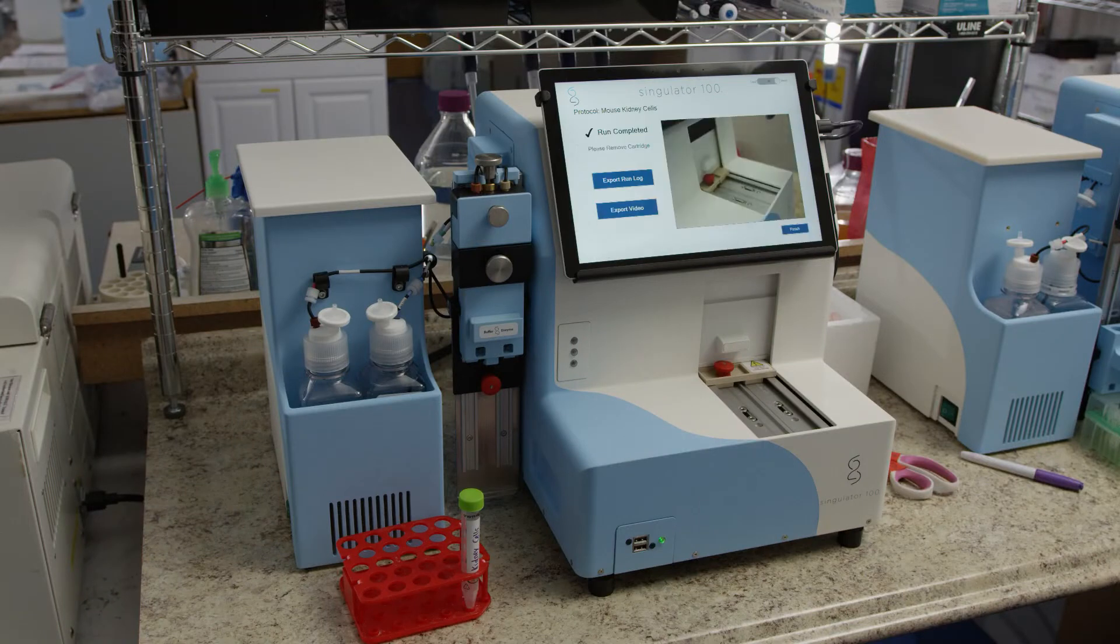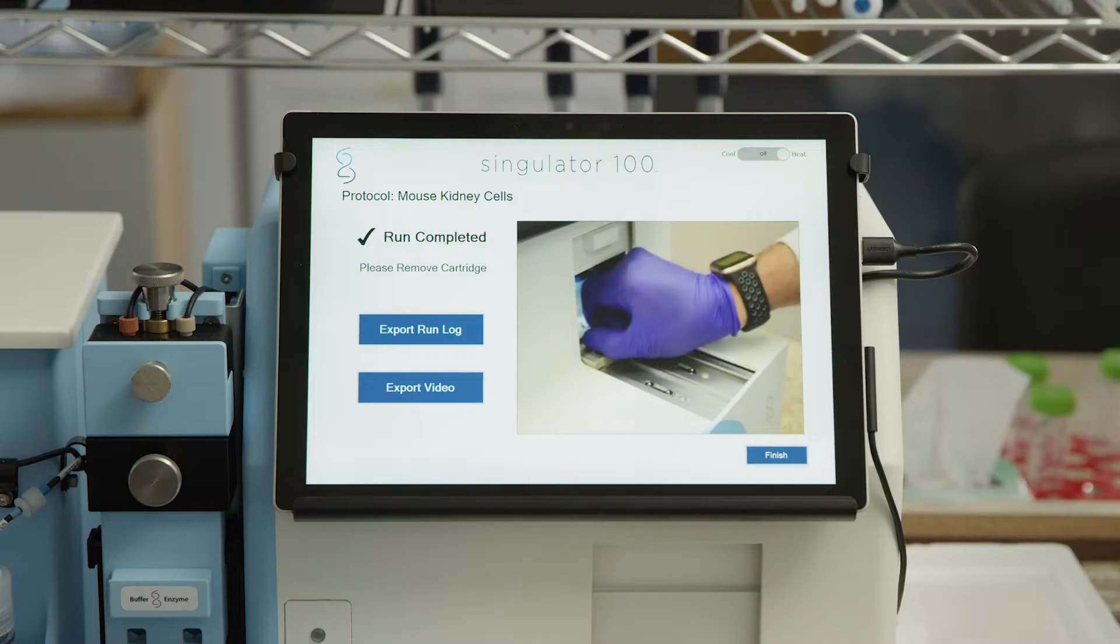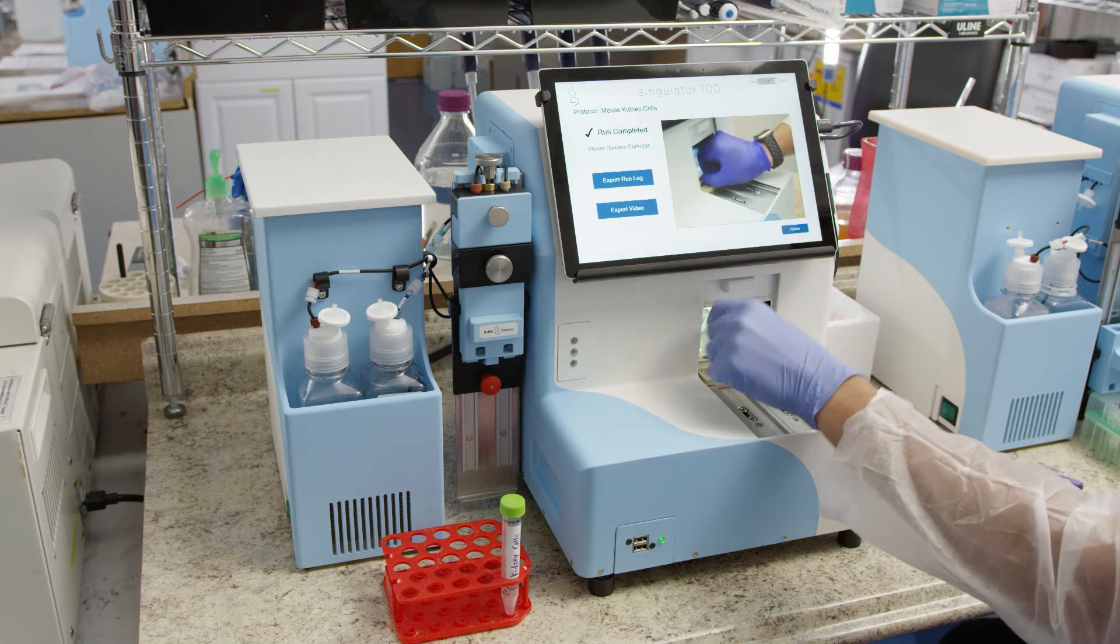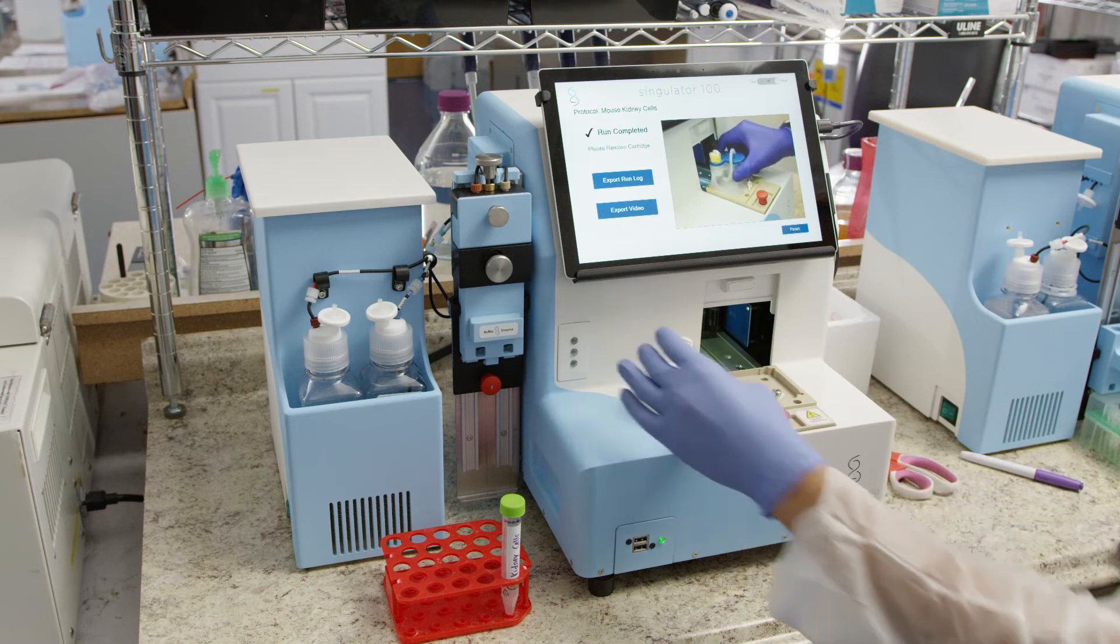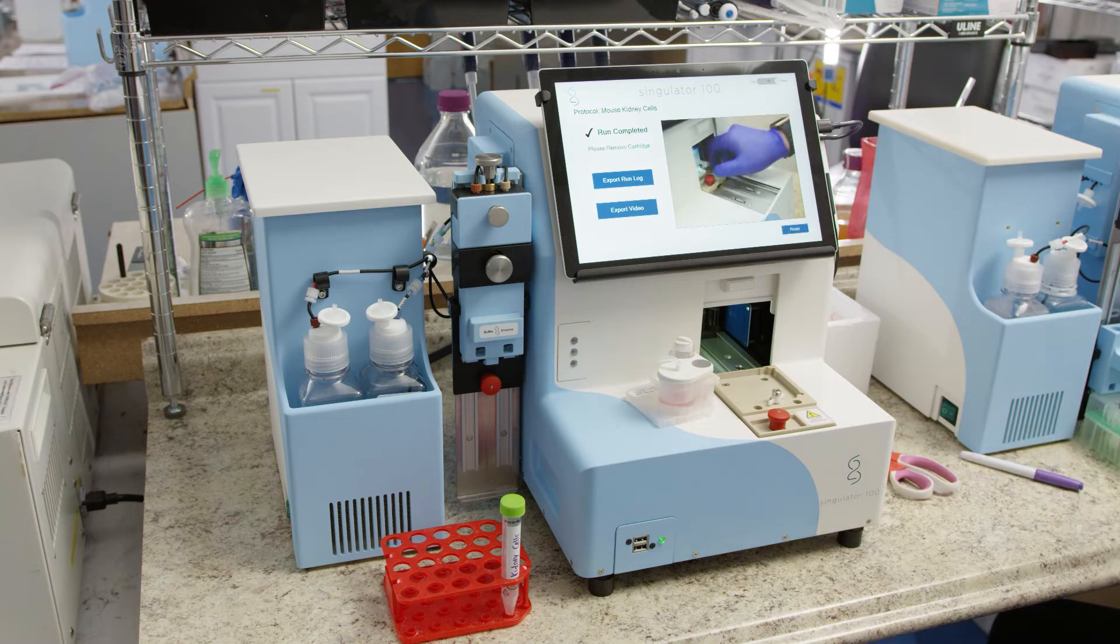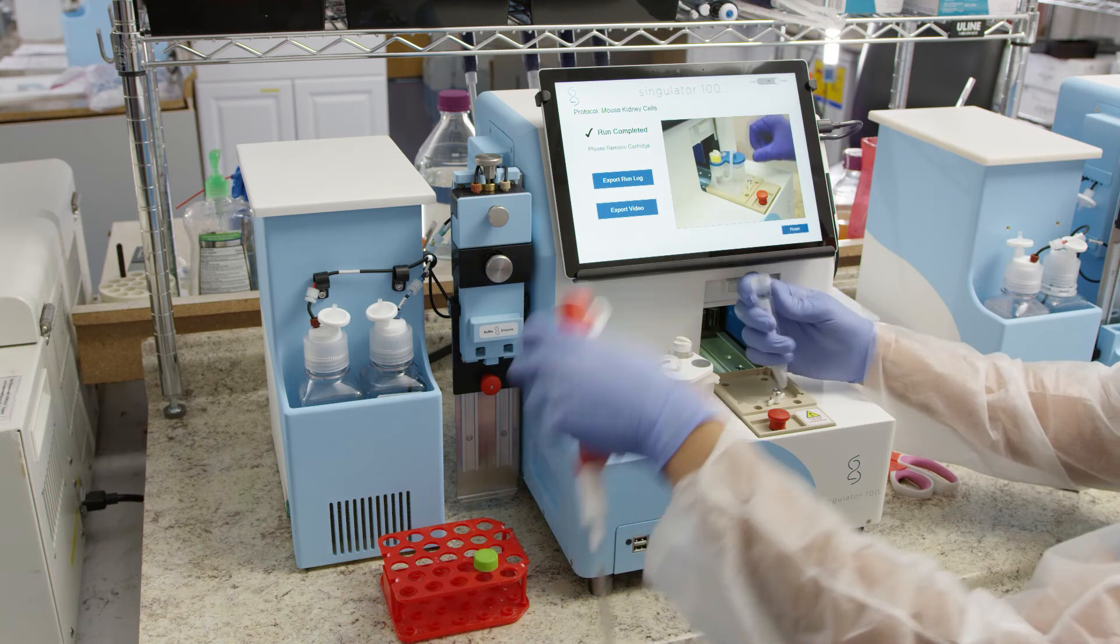The Singulator software will provide a notification when a run is complete. Open the door, lift the red knob to release the stage, and slide the stage out of the instrument. Turn the rear cartridge lock to release the cartridge and lift the cartridge off the stage. Place the cartridge on a flat surface.